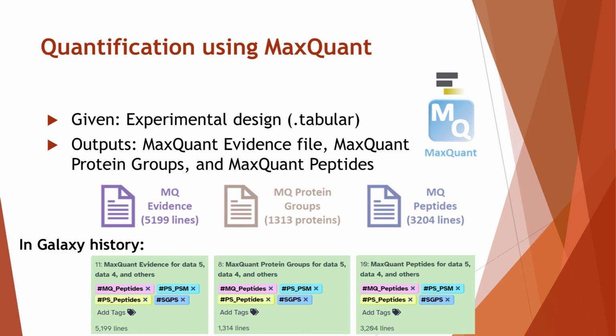The protein groups file will report all proteins that contain the sequences of identified peptides. Since our inputs contain a mix of human, microbial, and contaminant proteins, MaxQuant outputs will not differentiate between microbial and human sequences.